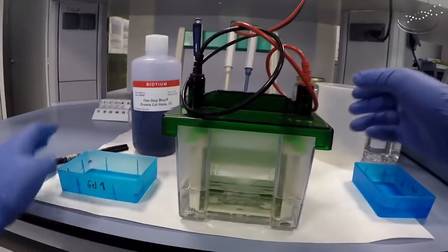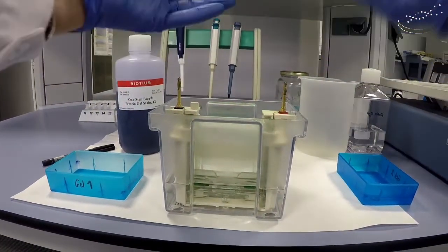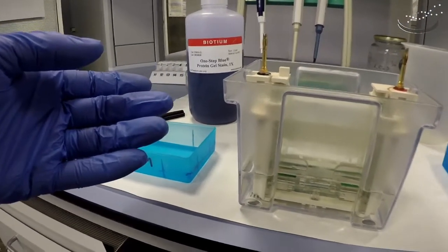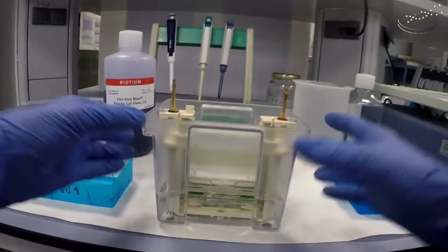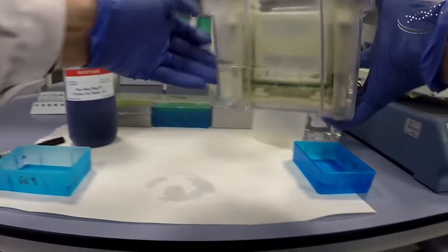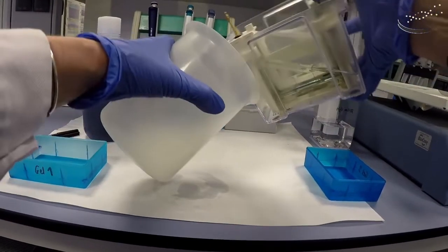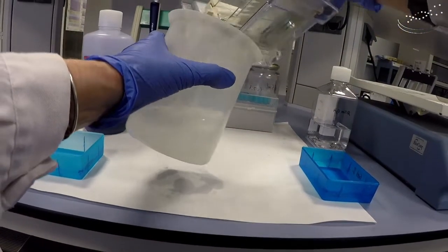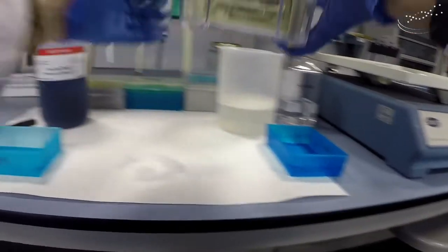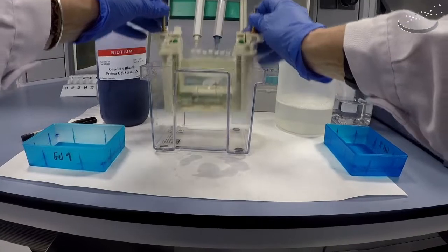We can see here the gel system. The first step is to take off the cover after electrophoresis has been completed. Once we take off the cover, we will decant the electrophoresis buffer either in the sink or in this beaker, being careful to make sure that the inner part of the electrophoresis system does not fall out.